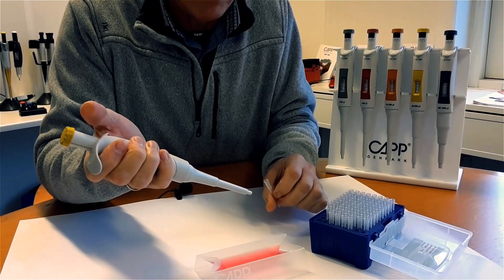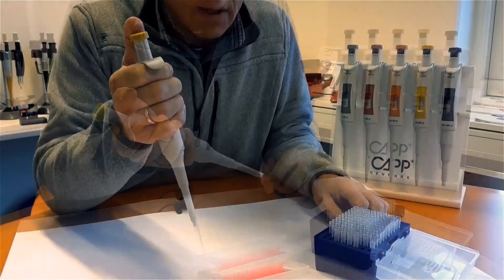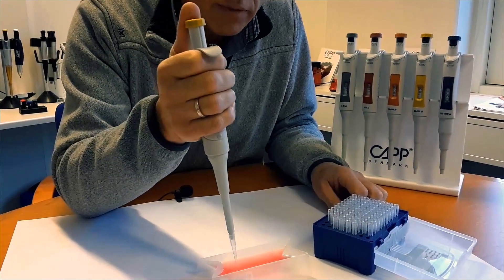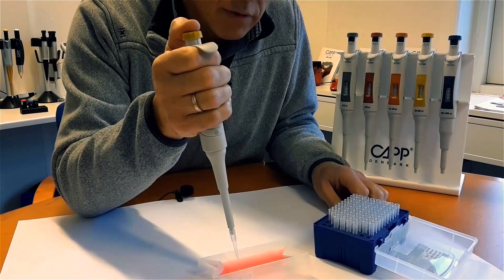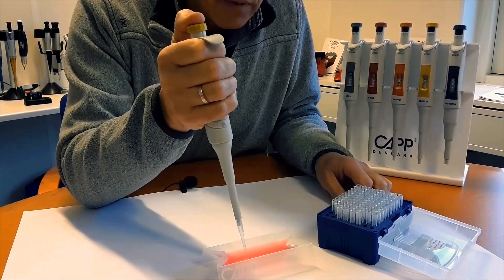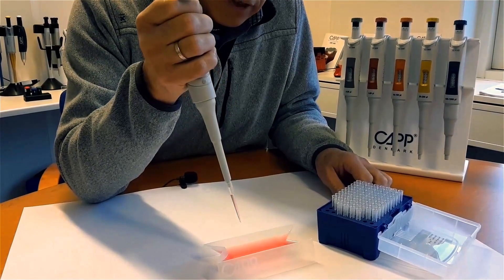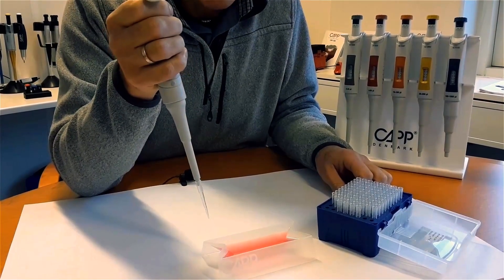In case of any discrepancy, please contact info at capp.dk. Aspirate and dispense some liquid a few times and check visually if the pipette seems to be working properly. Aspirate the liquid and hold it for a few seconds to see if there is any sign of leakage. You are done with the basic functionality test.